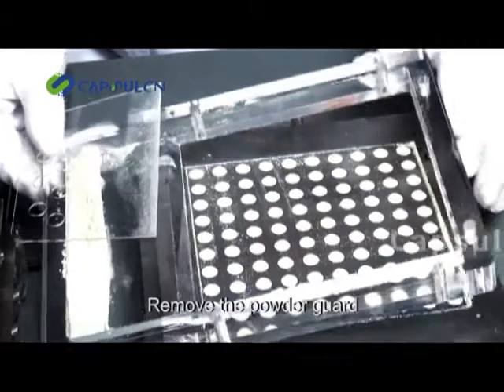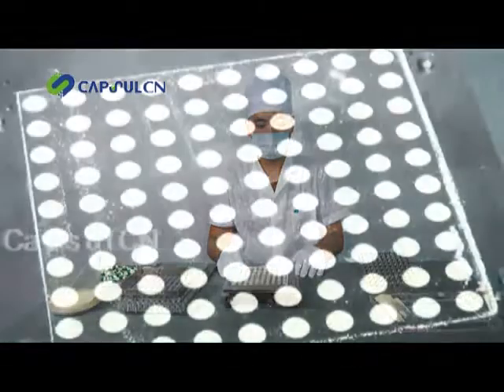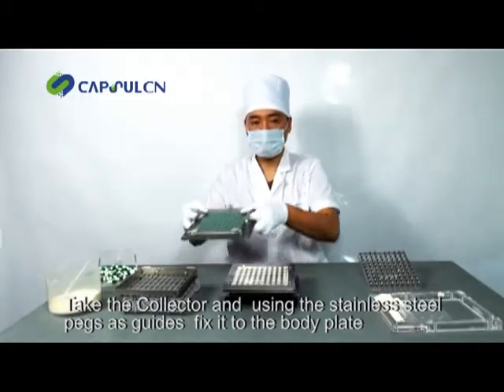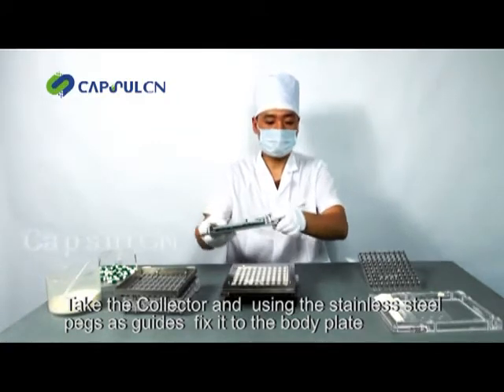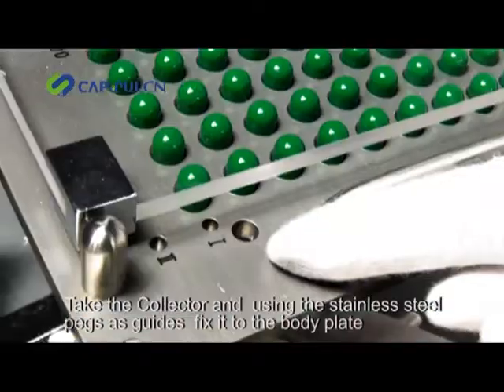Remove the powder guard, and using the stainless steel pegs as guides, fix it to the body plate.